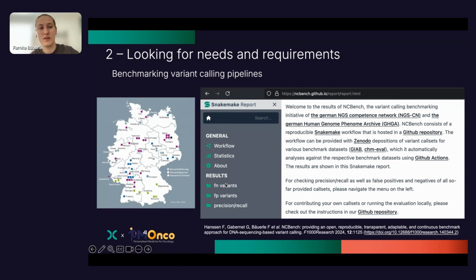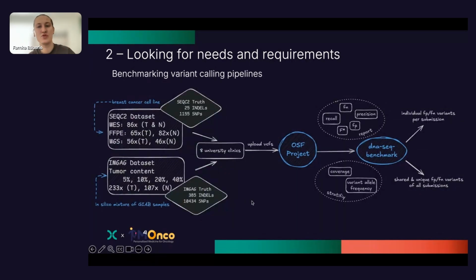And within this project, we expanded this to also be able to evaluate somatic variant calls. And I want to show you quickly our benchmarking study. This is a work in progress where I'm also working on a manuscript, so keep your eyes open if you're interested in something like that.